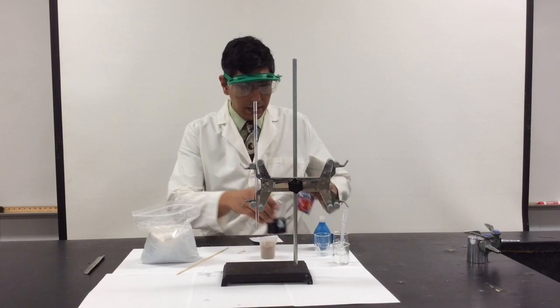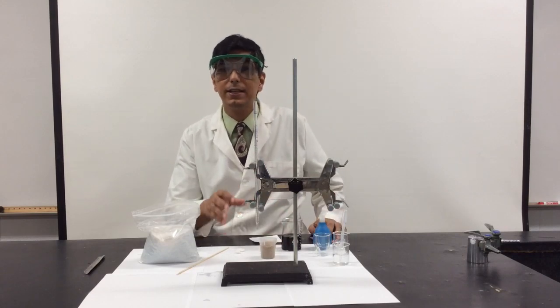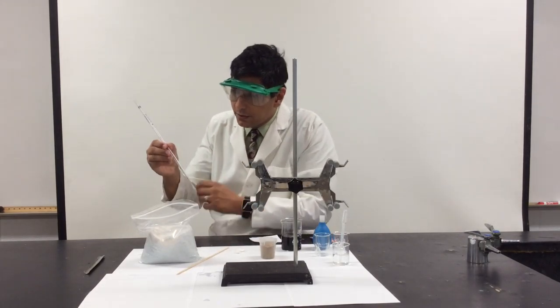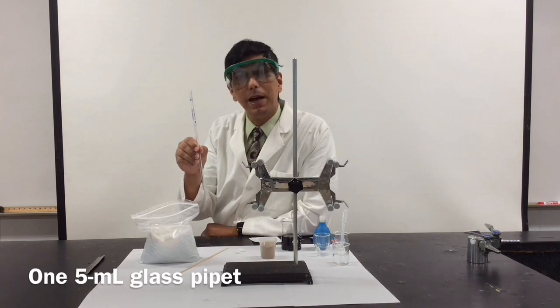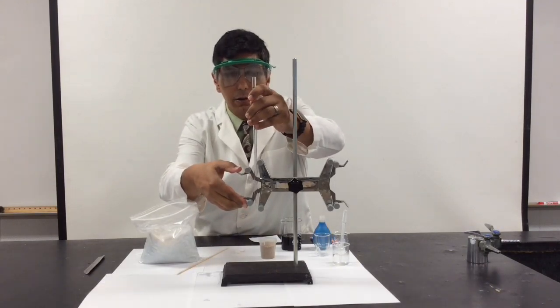And the mixture that we're going to separate is some grape Kool-Aid. We're going to separate that into its different dyes. Well, in order to do this, we're going to start with just a small glass pipette. And so I'm going to start by packing this chromatography column.